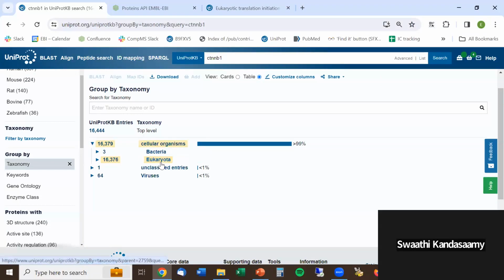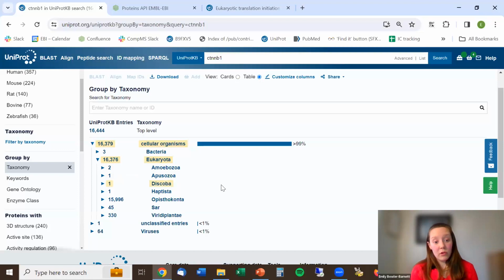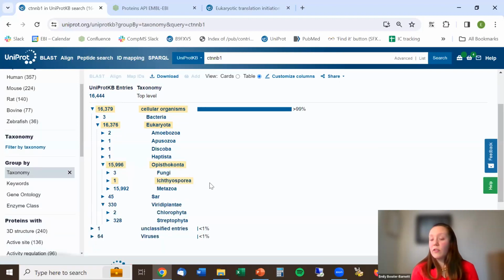You could put the query in, and then you could drill down to groups. You can either search by mammals or search by frogs. You're going to have a bit of variability between gene names if you do that, but for a rough query, yes, you could do that. I don't use that function often, so that's quite useful.